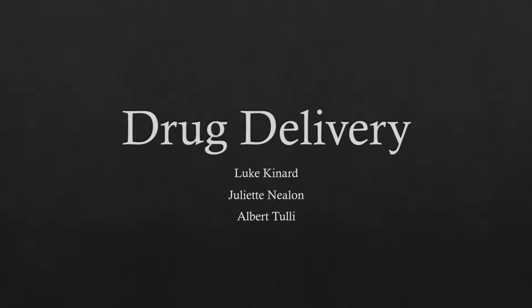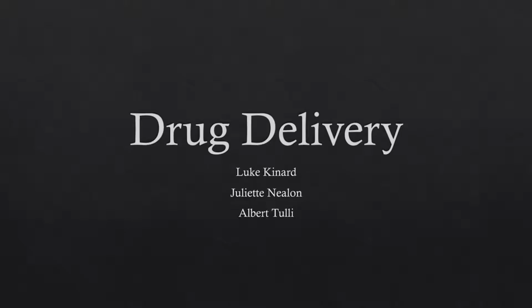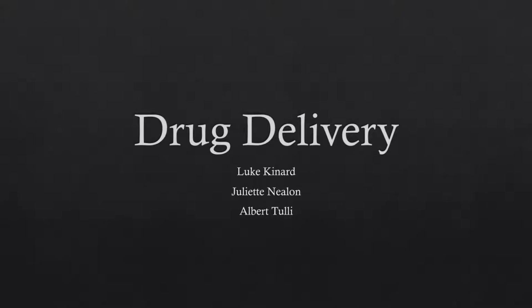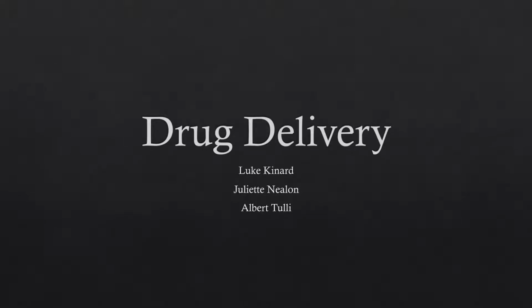This video describes the theory, procedure, and analysis of the drug delivery experiment performed by Group 9, Luke Kinard, Juliette Nealon, and Albert Tulli. An important application of chemical engineering in pharmaceuticals is the rate of drug delivery into the body of the consumer. The rate of drug release is necessary knowledge because ideally the drug should be effective immediately and should provide relief to the patient's problem area.